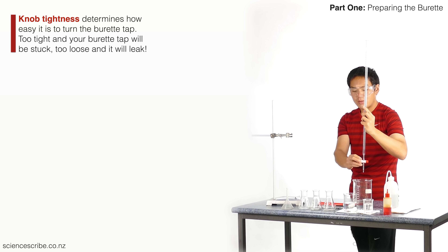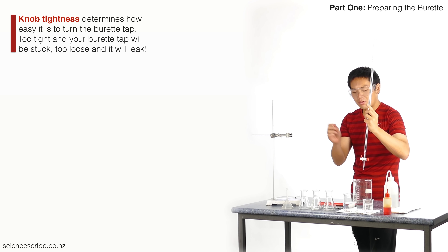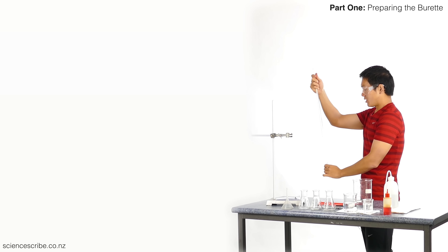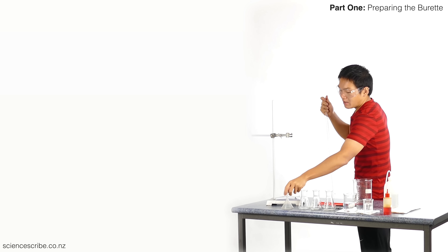So you want to find a compromise — generally somewhere where it's quite comfortable. Okay, to clean this out with the solution I'm filling it with, since I am filling it with hydrochloric acid, I'm going to put my funnel over the top.